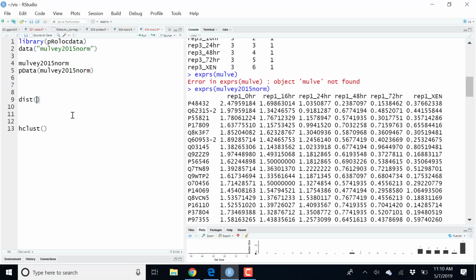Okay. But what I want to do now is the clustering, my hierarchical clustering on my samples. Okay, bear in mind that all the techniques that we're going to see, we can use them to study the patterns in our samples here or in our features. And some of the examples that we'll see will do one or another.